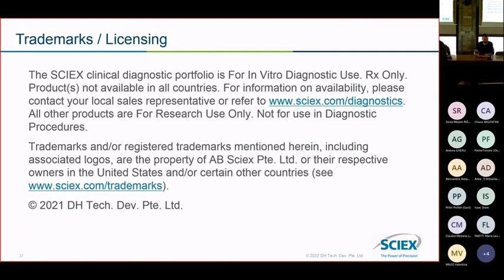Always ask the stupid questions, yes. It was unclear which HPLC you're working with in the presentation. You did not really mention this. Yeah, I didn't mention it. SCIEX is LC agnostic. But in this case, we used the Waters M class.